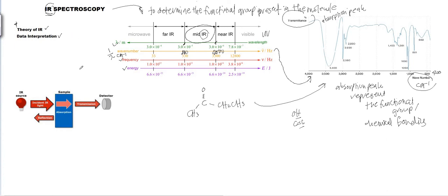Okay, so when we go for the instrumentation, still talking about similar thing, masih cakap pasal benda yang sama, but the most important one when we talk about the IR ni, kita kata this one is focus on the vibration. When we talk about the UV-Vis, fluorescence semua, it is more focused towards the electronic transition, right? What does it mean by the electronic transition? I hope you still remember regarding this one. So that means it absorbs electromagnetic energy within the UV-Vis punya range, okay, to jump from the ground state into the excited state.